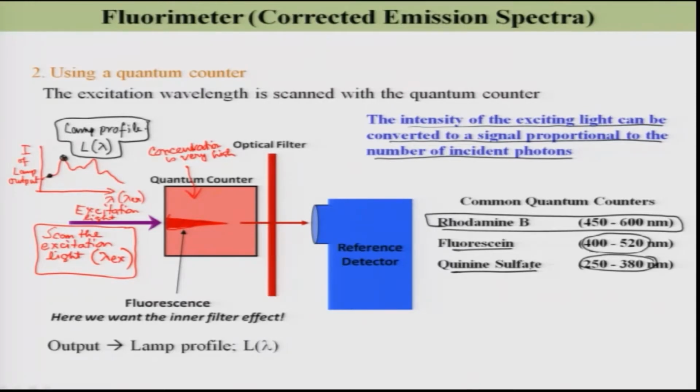So, hopefully you understand how to correct the emission spectra. And whenever you use fluorescence spectroscopy in your life, please remember that we should report the corrected emission spectra, not just the simple emission spectra.